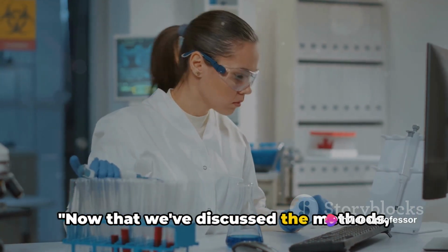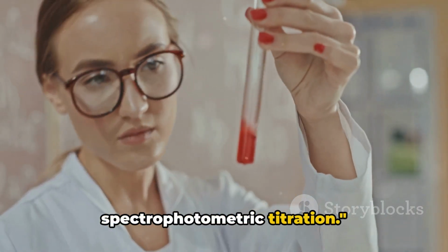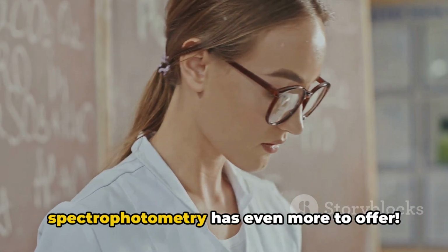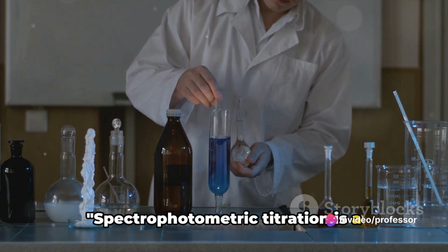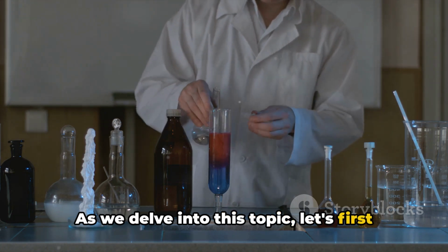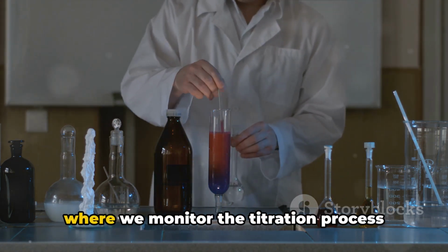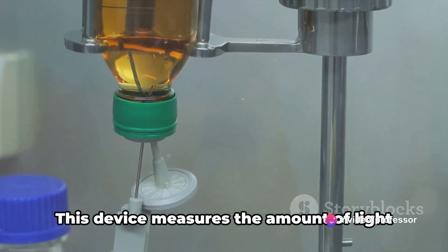Now that we've discussed the methods, let's look at a practical application: spectrophotometric titration. Stay tuned, because the world of spectrophotometry has even more to offer. Spectrophotometric titration is a fascinating application of UV visible spectroscopy. As we delve into this topic, let's first clear up what it entails. Spectrophotometric titration is a method where we monitor the titration process with the help of a spectrophotometer.